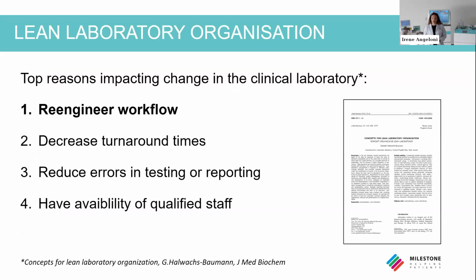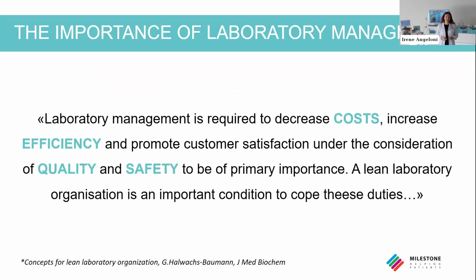According also to a study, among the things that help the change in the lab towards these needs that we have just seen is to re-engineer the workflow. So to have a better management of the lab to meet those needs, I need to re-engineer the workflow. This is essential.